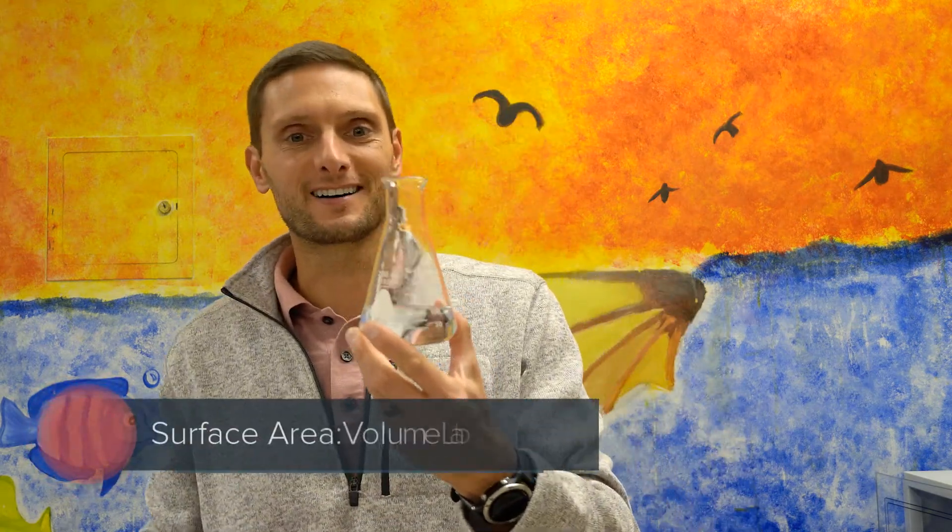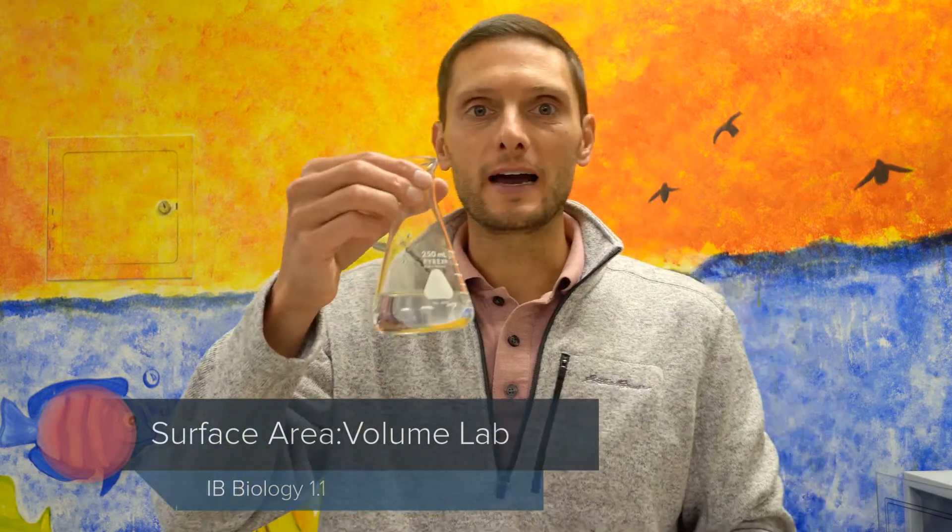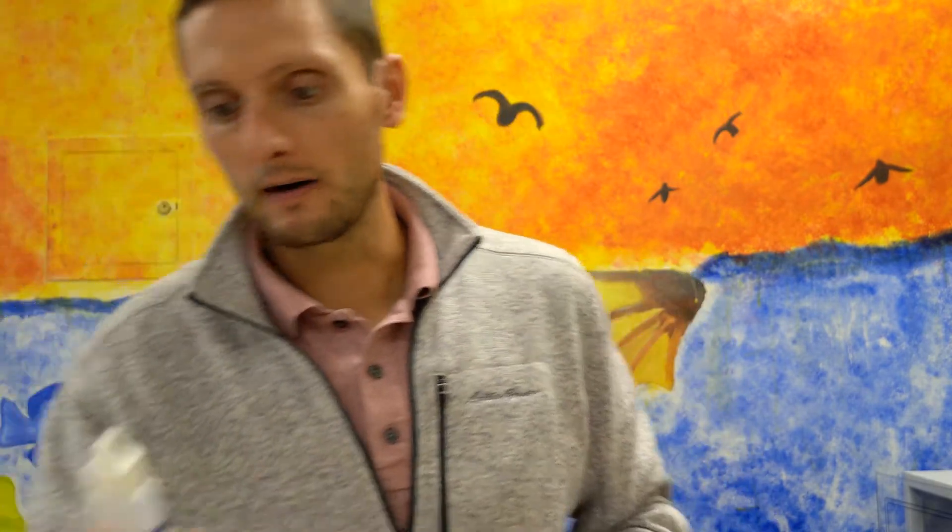I have here one of my favorite types of glassware, the Erlenmeyer flask. In this Erlenmeyer flask I've added about 100 milliliters of water and a chemical called phenolphthalein — about five drops. It's a chemical that, when it reacts with a base, causes a chemical reaction that results in a change of color.